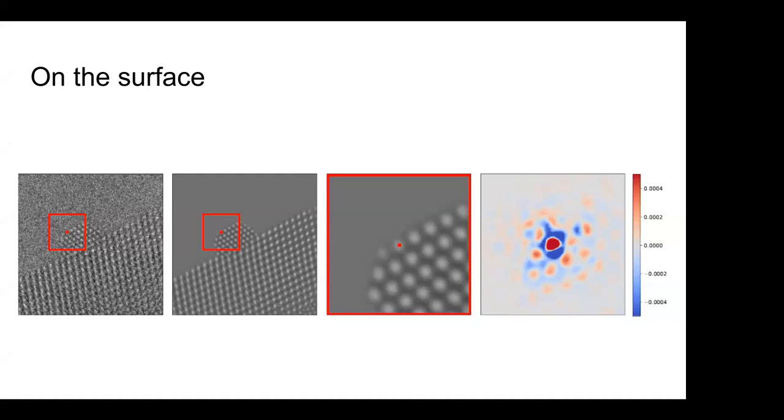Sorry, one question. It looks very cool, but I'm just not fully understanding it. How do you get this gradient plot? You have a noisy patch, you have a denoised patch, and how do you get this gradient?